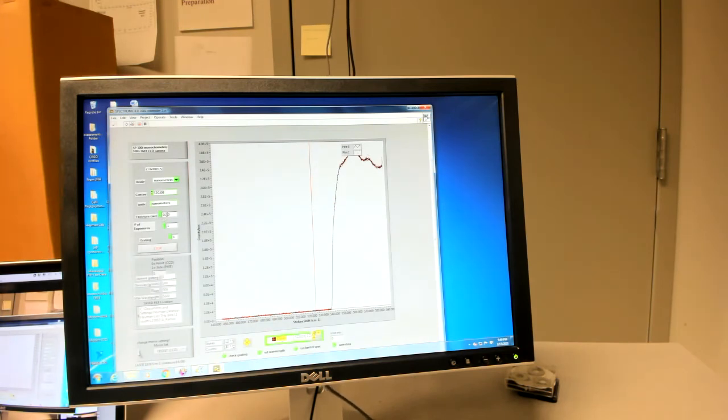Here, if we set this to a longer time, let's say 0.4 seconds, we can run it again. Notice the height here, almost 4 times 10 to the 5. Off it goes. Now it's done. We won't save that. It's a similar height now because this is actually showing you counts per second.